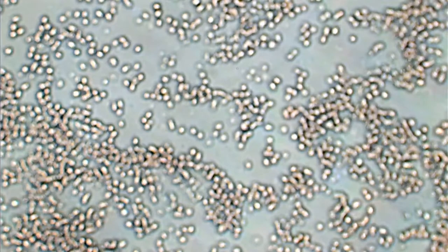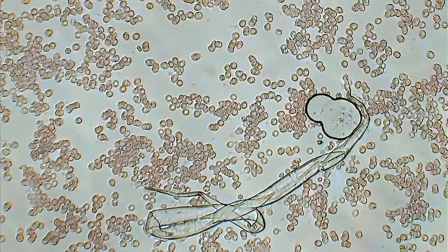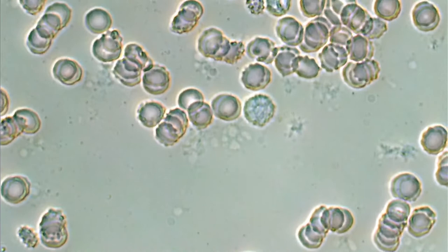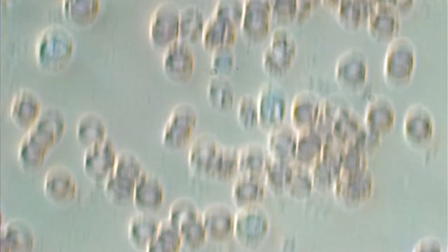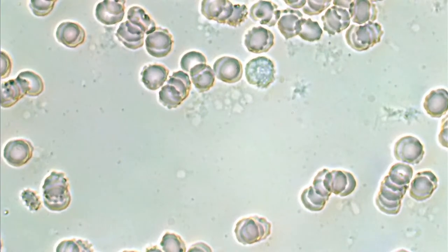Of course, the first sample I stuck in there was my own blood. That was 10X, this is 25X. There's some random junk in there. At 40X, you can see that after 30 minutes on the slide, a number of the red blood cells are getting deformed and some sort of bacteria is having a blast. All those little jigglies — ciliates, maybe? I don't know. There's the occasional leukocyte too.